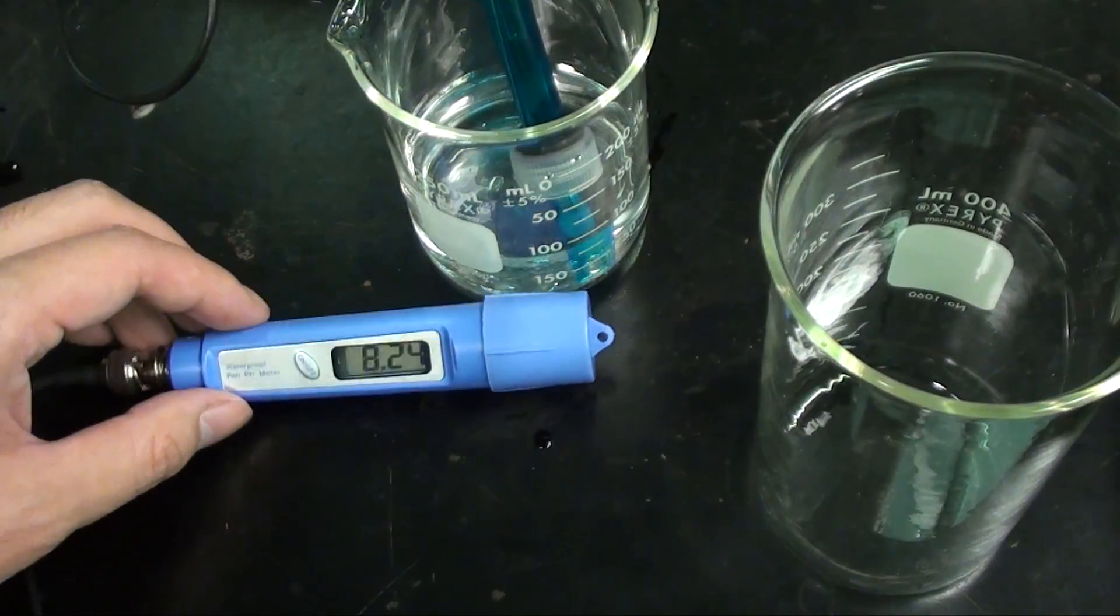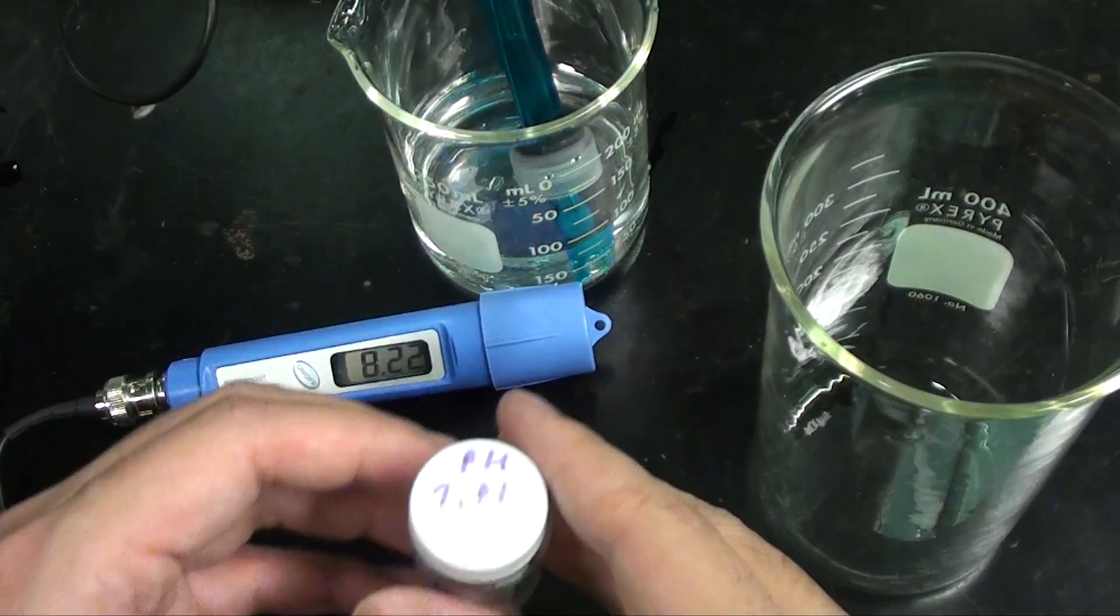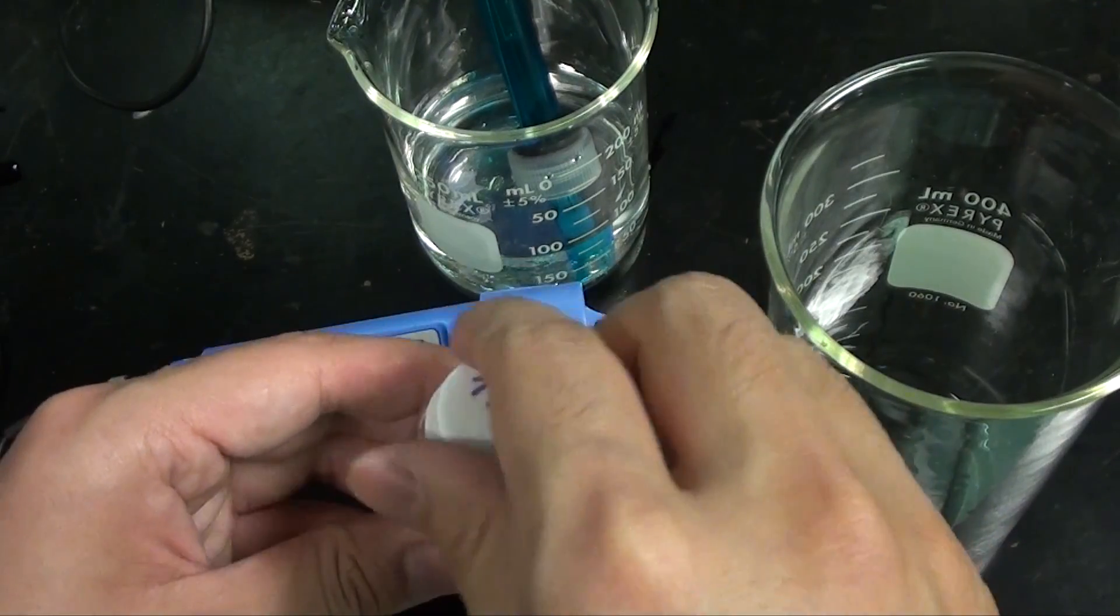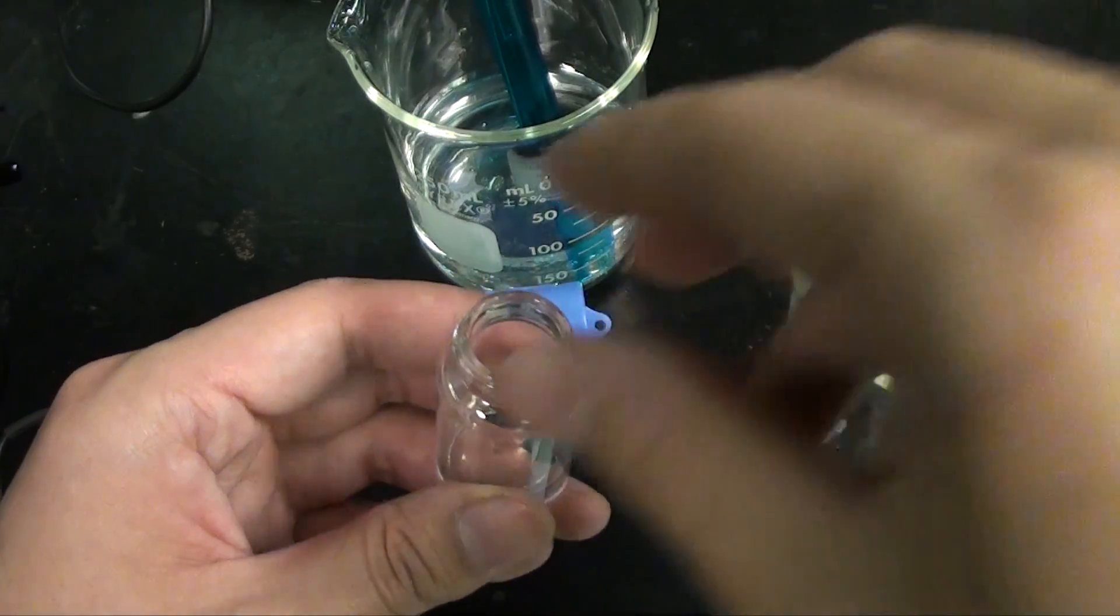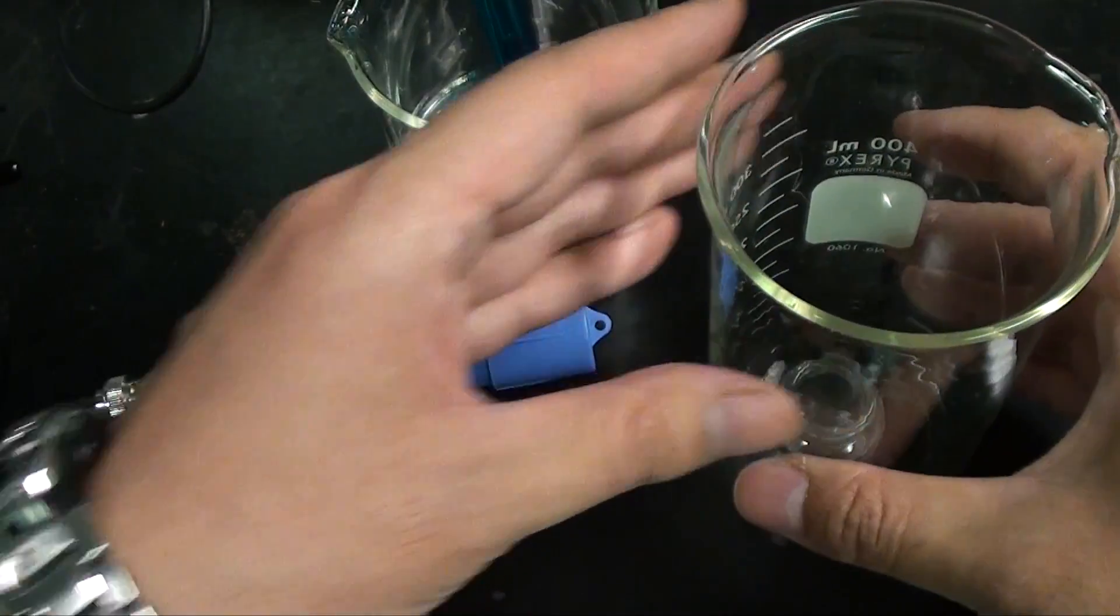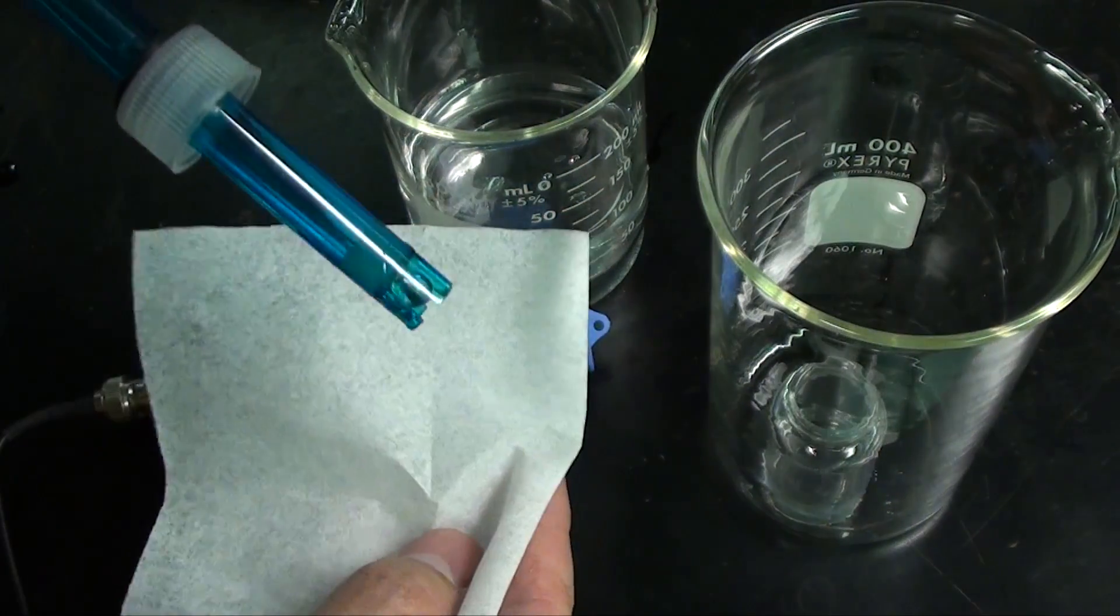So here is a sample of the calibration solution. This particular one has a pH of 7.01 at 25 degrees Celsius, which is the current temperature of my lab. I'm putting it in the beaker because the vial can't hold the electrode by itself.